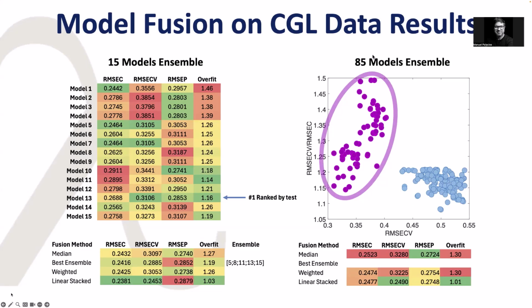And here on the right, we are going to show the 85, whenever we pick a bigger number of models. Apparently, it's also very early for me today. So here we have 85 models. In other data sets, we are going to have more, or we are going to have less.